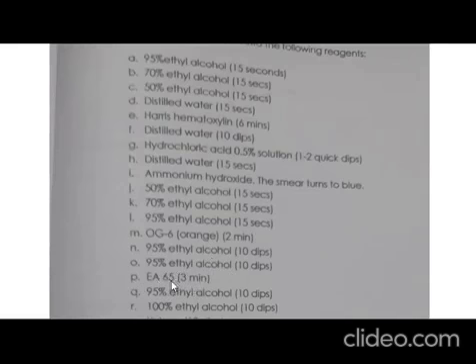But this one, it is already capable of inducing different colors, not only orange like your OG6, but this one can now produce different colors that you can observe under the smear. Okay, then after immersing it to EA65, you again immerse it to 95% ethyl alcohol. So the purpose of 95% ethanol here is for rinsing again.